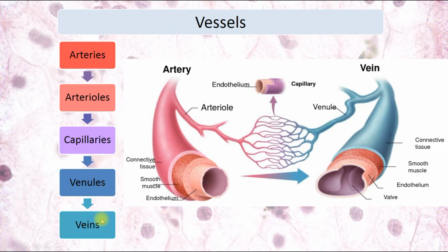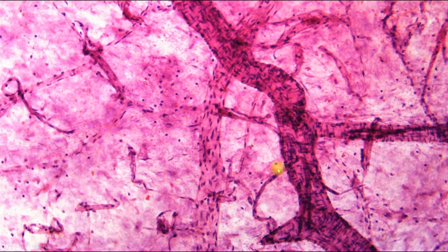We have two routes of circulation, small and big, and both they have arteries, veins, and between them we have microcirculation or microcirculatory bed. And we will begin from the microcirculatory bed, from the capillaries, from the smallest blood vessels. So here we can see histological slide which shows us microcirculation, the smallest blood vessels. Here we can see the smallest are the capillaries, and also we can see here arteriole, venule, and they provide circulation inside the tissues, inside the organs.